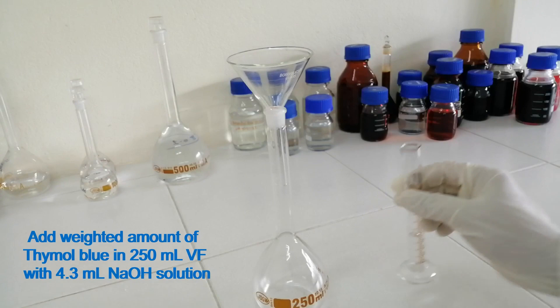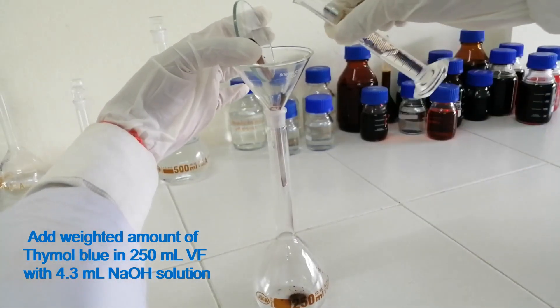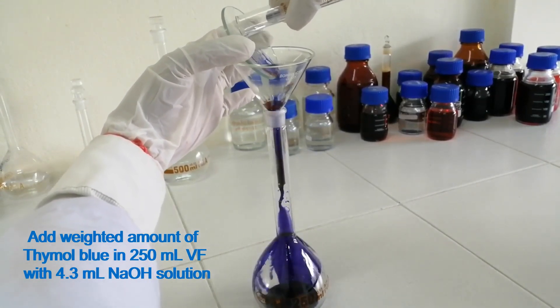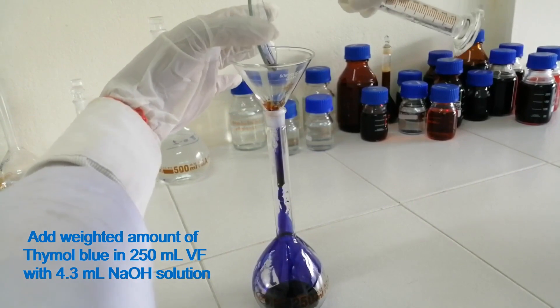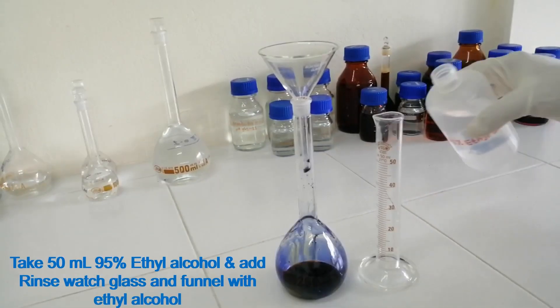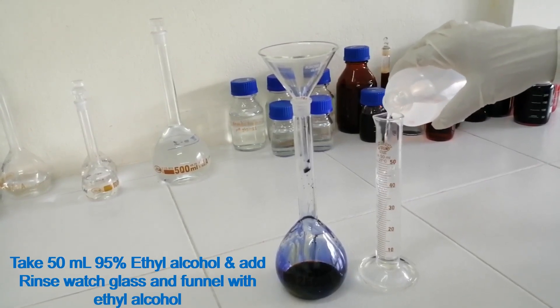Add the weighed amount of thymol blue in a 250 ml volumetric flask with 4.3 ml sodium hydroxide solution. Take 50 ml of 95% ethyl alcohol and rinse the watch glass and funnel with ethyl alcohol.